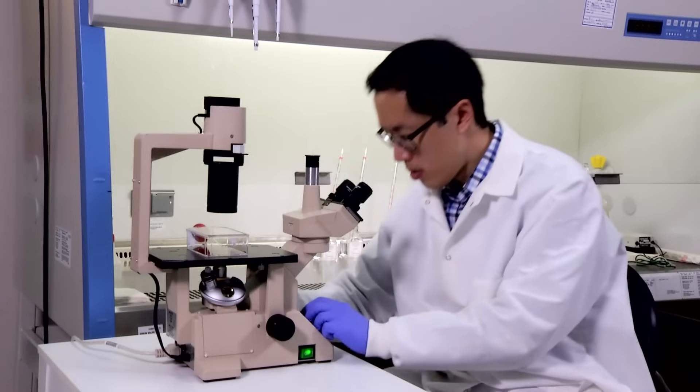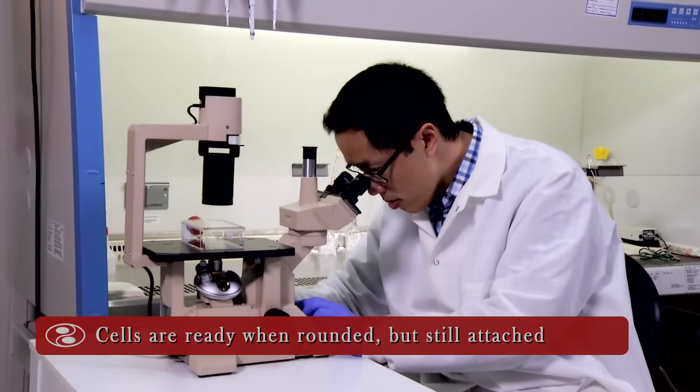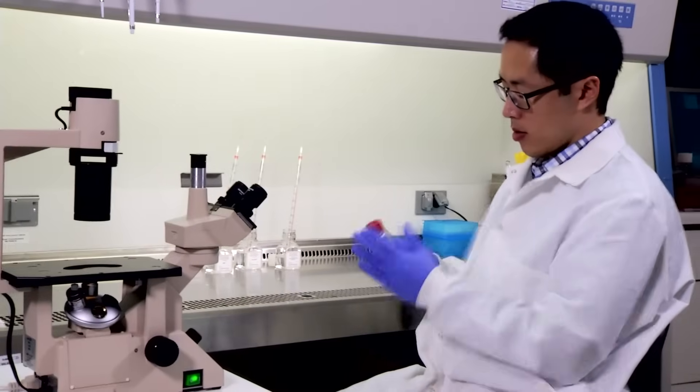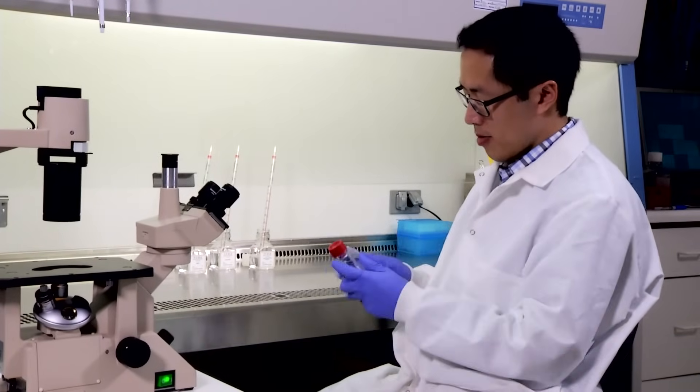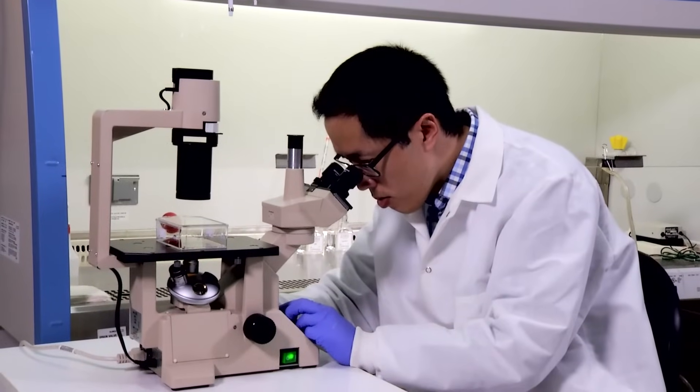Observe cells under microscope. Cells are ready when rounded but still attached. Hit flask against palm to detach cells. Check and detach cells again if needed.